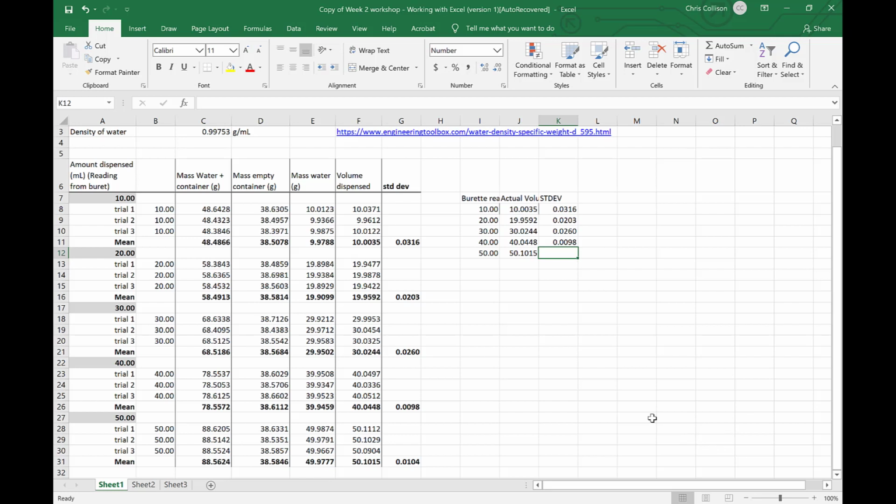In this particular case, it doesn't matter which approach you take, but I think this is also quite valuable to demonstrate the use of that equals function, so that if I change a number, for example, let's change this number arbitrarily to 49, we'll see that the standard deviation value changed automatically in here.